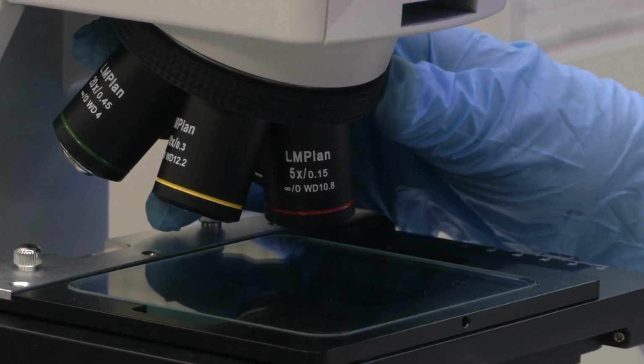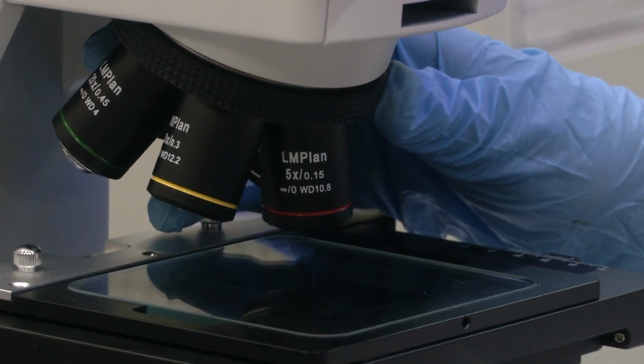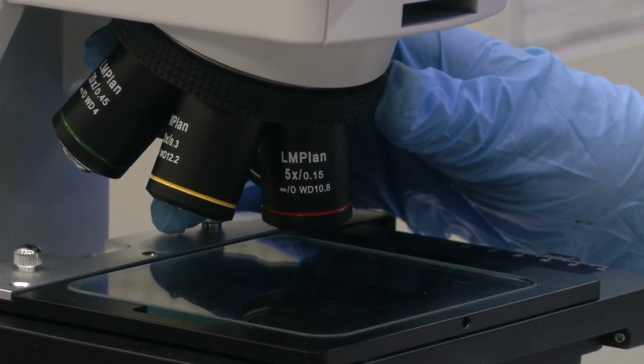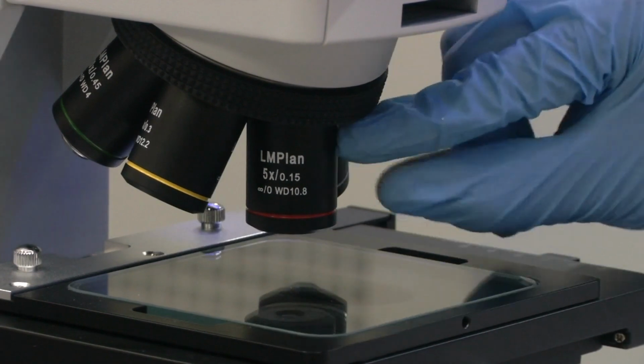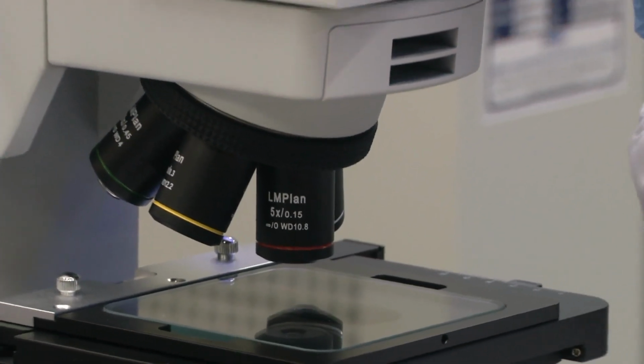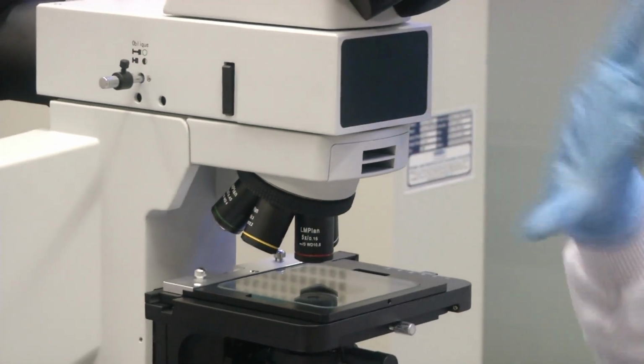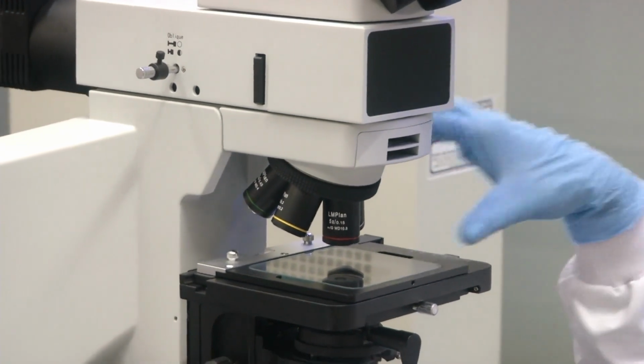This is usually the smallest objective lens provided on a microscope. It will either be 5x, 3x or 4x. So, this 5x lens will provide 5x magnification. The eyepiece already has 10x magnification. So, effectively 5 into 10, you will be seeing your sample at 50x magnification. That is the overall principle.